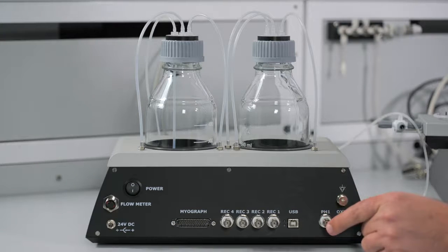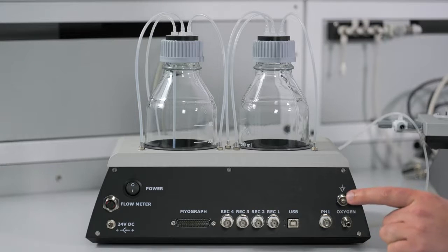There's a connection for a pH meter to measure the pH in your chamber, a connection for ground to eliminate any unwanted electrical noise, and lastly, a port for your gas tank which we'll use to pressurize the interface.